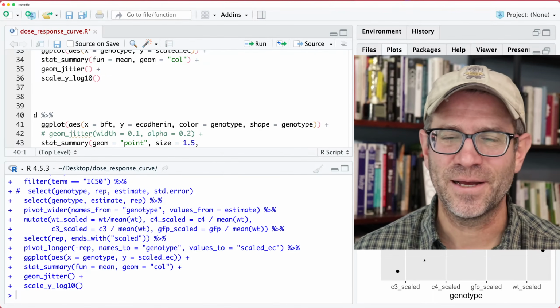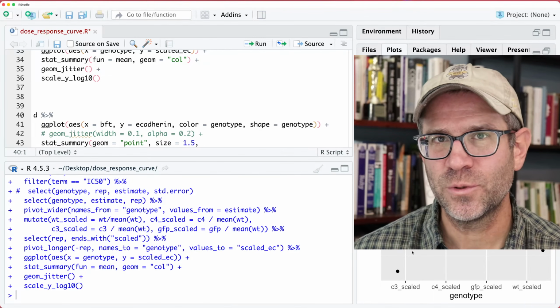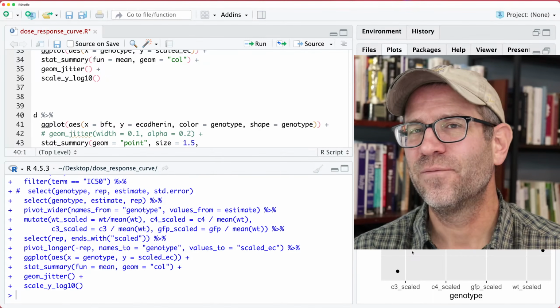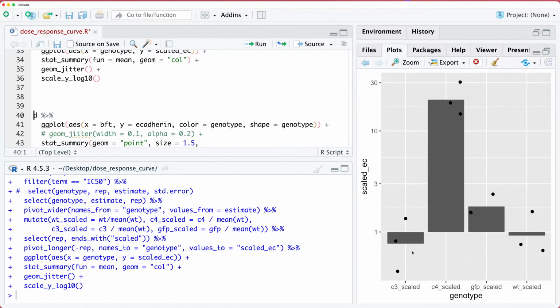I think it's kind of funny because ggplot2 is what's called opinionated. That's technical jargon for how Hadley Wickham and the developers of ggplot2 have created it. They make it hard to do things that you shouldn't do, right?